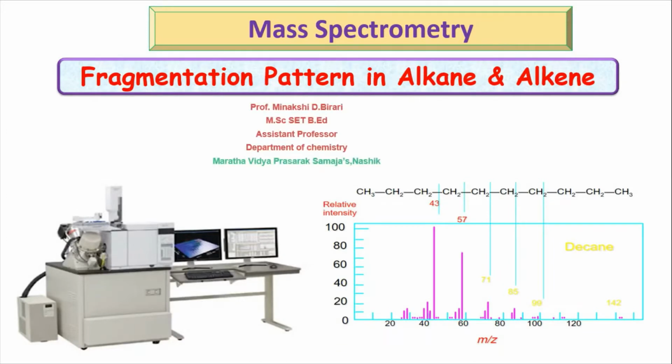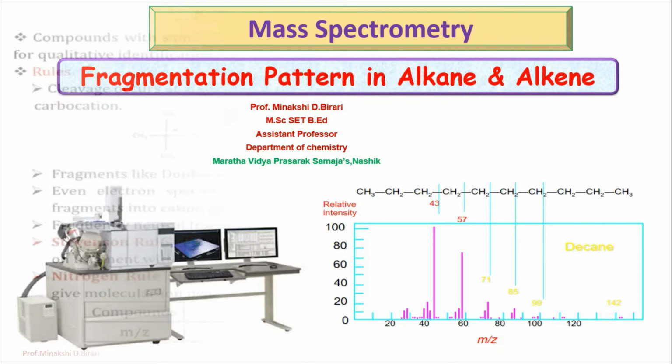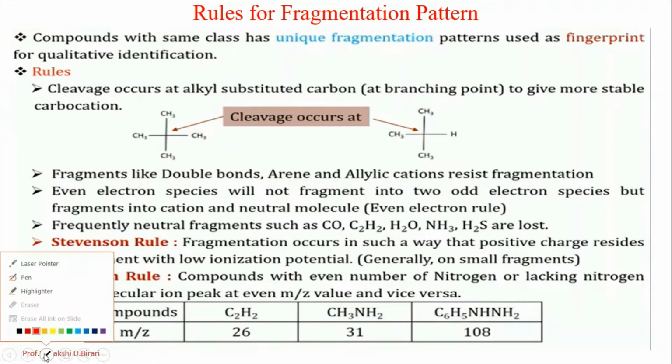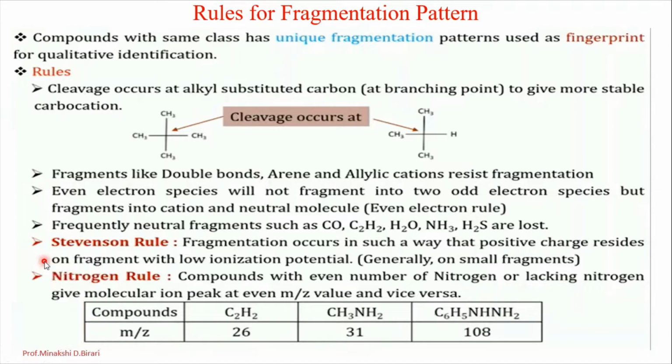Hello everyone. In today's lecture, I am going to explain the fragmentation pattern in alkane and alkene. For the study of fragmentation pattern in different classes of organic compounds, it is necessary to understand the rules of fragmentation. So, let's begin with the rules of fragmentation. Already in the previous lecture, we have studied the rules of fragmentation. Now, let us see in brief.